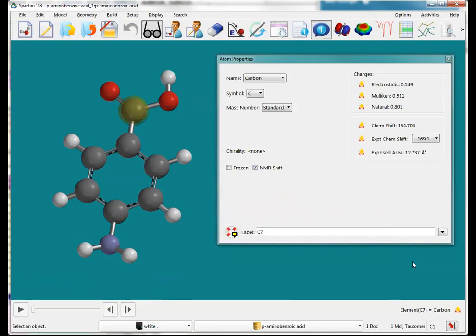But what we've done now, and we're on our 3rd generation of empirical correction schemes, is we've got a system in place that takes into account the calculated shift, but also the knowledge of its neighbors. So we've got a big parameter scheme based on thousands of sp2 carbons at an adjacent position, or sp3 carbons at an adjacent position.